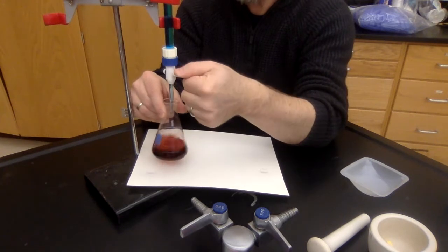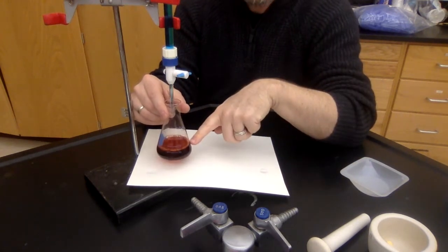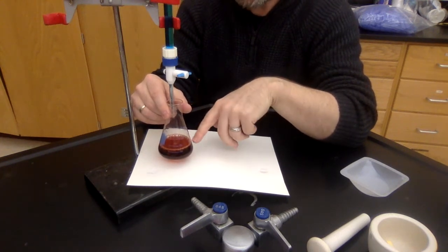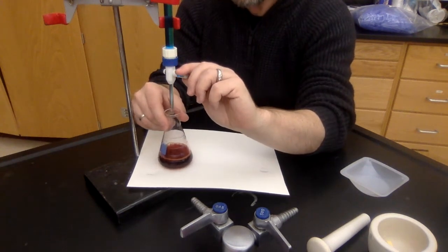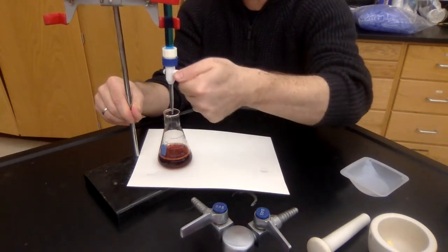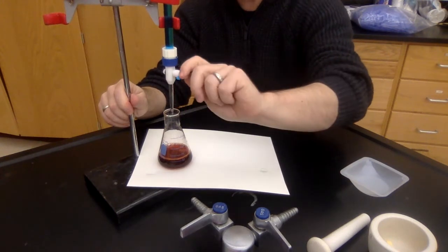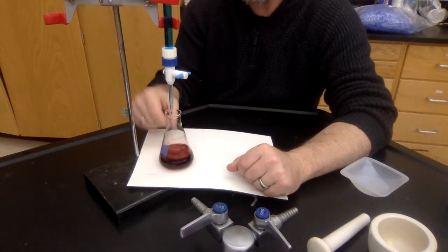When you start to get close, you'll know because you'll start to see a little bit of color changes happening that don't persist because of that indicator. When you start to get close, I recommend that you start doing these half turns. And so it's just sitting here and you just go boop, you just do a half turn and it puts a tiny little squirt in there. This is kind of that mid-range amount that you're adding before you actually are going drop by drop.